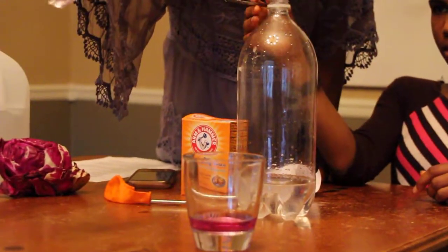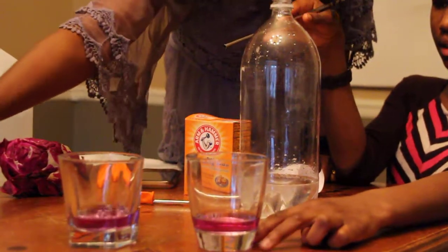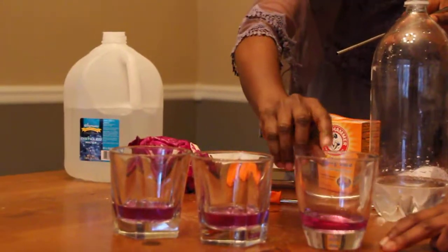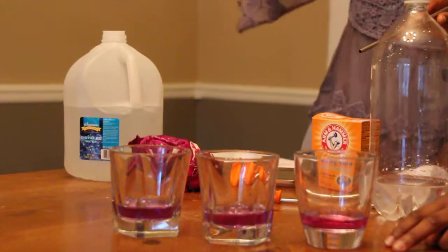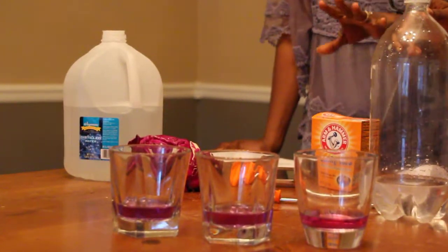I am not seeing a change in the color. All right, so this has not worked. This one did. Skylar thinks she saw a change. I'm not convinced that we saw a change. I'm gonna try this one more time and see if we can get a change. But here's what we would expect to see.